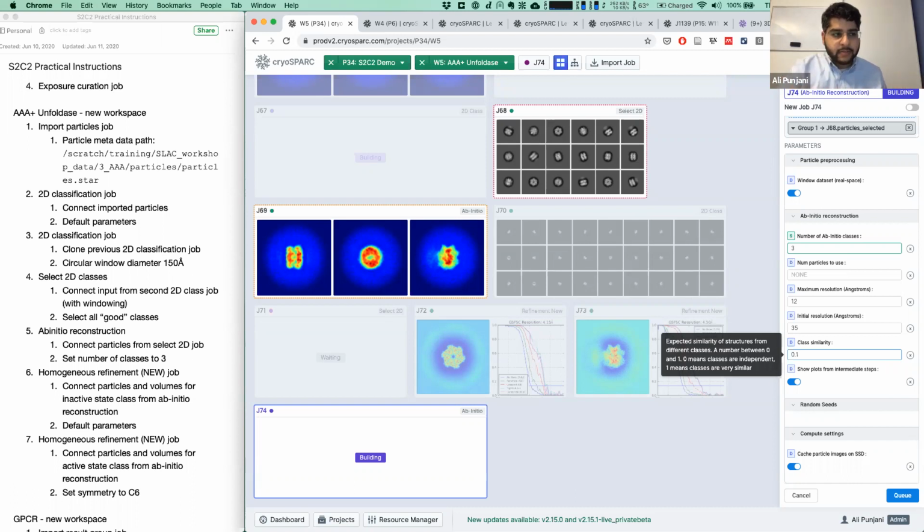At the end of the day, the algorithm is not forced to do that. It can still find very different things, but this parameter controls a sort of guidance that we're giving the algorithm in terms of what we're looking for. By default, it's set to 0.1, and that generally works quite well in most cases. But sometimes if you're looking for a specific kind of result or trying to tease out some other interesting kind of heterogeneity, you may want to play with this parameter.